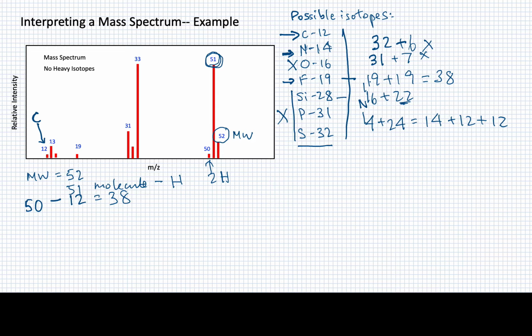All right, so which one is more likely? I'll just point out that if I start trying to construct a Lewis diagram, it's got to have a total of 3 carbons. So let's put this down here: 3 carbons plus a nitrogen plus 2 hydrogens. So I have a total molecular formula of C3NH2. I can try all I want, but I'm going to have a hard time putting together a good Lewis structure that includes this set of atoms.